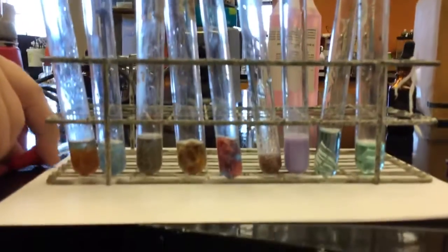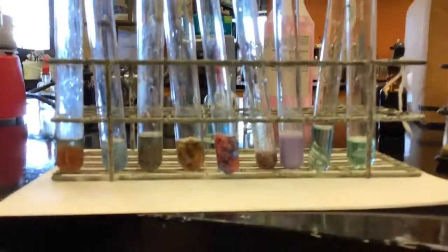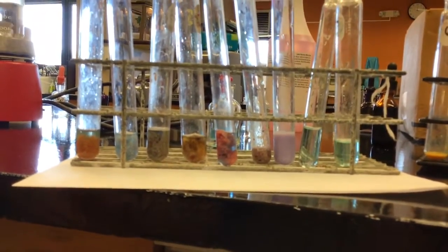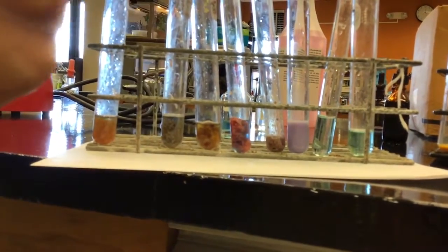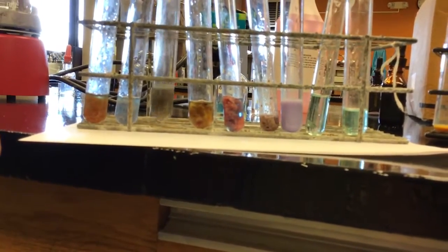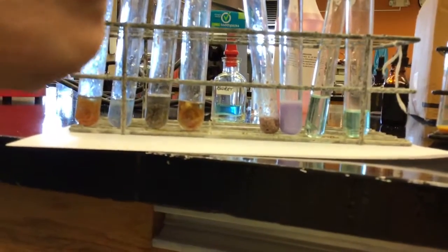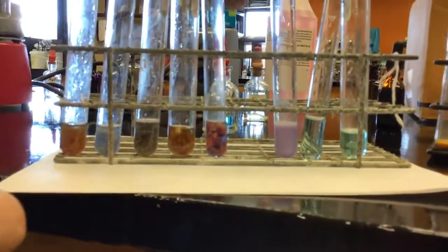Okay, we're a minute into our 2 minutes. You can see some of the stuff has changed some color, but right now we're really just seeing the blue color of the Biuret to start. This is when it really gets fun. That purple? I don't know, is that purple? It's got protein in it, doesn't it? Well, yeah. Maybe the protein doesn't come out into the mixture. I don't think I need to mix that, or the liquids.